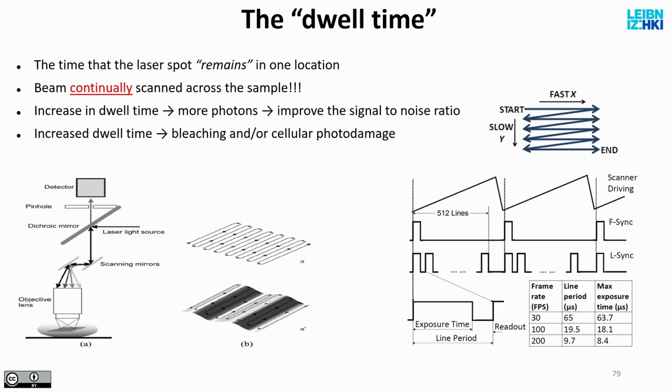As we are scanning the sample, I also decide how large an area of the sample we scan. I can say scan the whole sample, or scan 100 by 100 micrometers, or scan 20 by 20 micrometers. If I keep the number of pixels the same, what did I do?